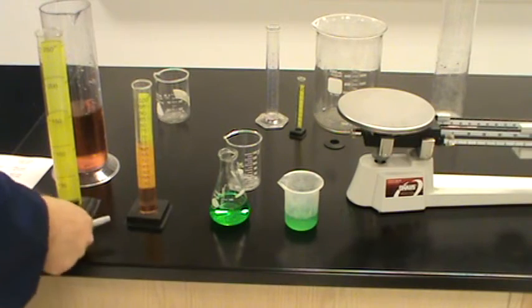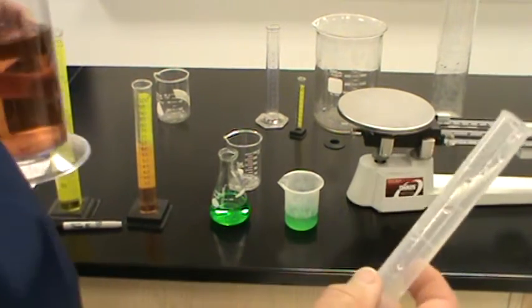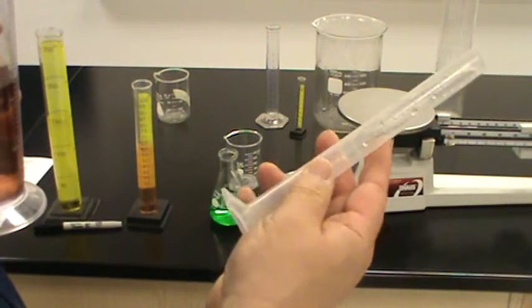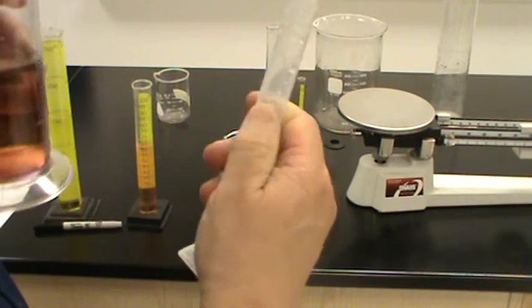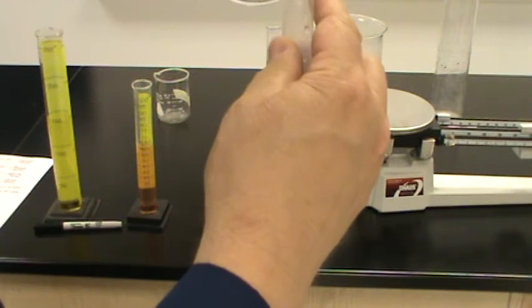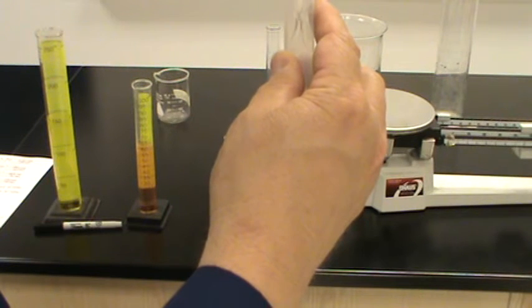Into this graduated cylinder, I also wanted you to put 20 milliliters. That meant that we had to find 20 milliliters. Well, this is in 5s: 5, 10, 15. 20 is this line right above my thumb. So we're going to come in here. We're going to pour. Bring up, up, up, up, up.